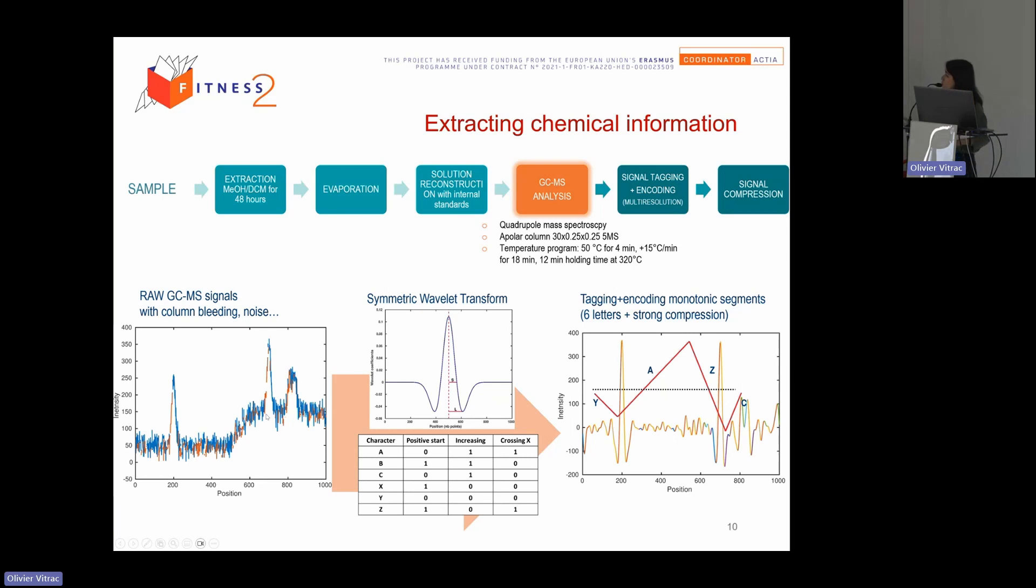So here, for example, we have the raw GC-MS signal with column bleeding, the noise. So it's not something really nice, but we see often this kind of chromatogram when we use low resolution GC-MS. The first step we apply, we transform the signal in symmetric using a wavelet transform. With this step we remove the baseline, we make them more resolutive, we can isolate the peak, we can also detect the systematic signal of the detectors. And we tag and encode the signal with six letters. So we have strong compressions and we have some signal invariable with the detectors and apparatus.